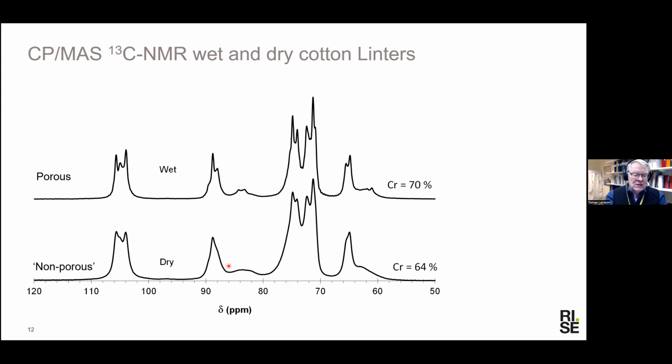You might have some 6 to 7% water, or moisture, in this material, but still it's not sufficient to release the stress concentration that can be built up during drying. The surface regions are broadened and they lose their shape because we are now effectively constructing a very, very large fibril aggregate. So that's not so strange.